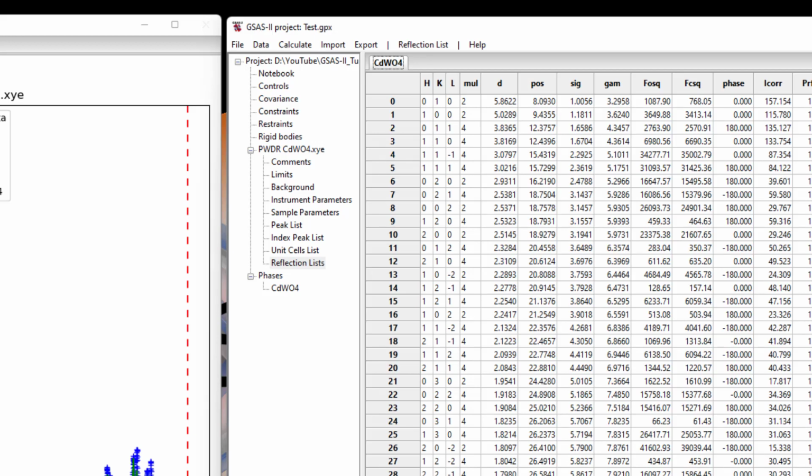You may have a question why this has a slight difference. I think maybe you need to spend a little more time and try to improve further. About this one, I'm sure that because this data is coming from nanorod, and nanorod has a preferred orientation, the intensity is slightly higher for these two planes. So anyway, I hope it helped you to learn.